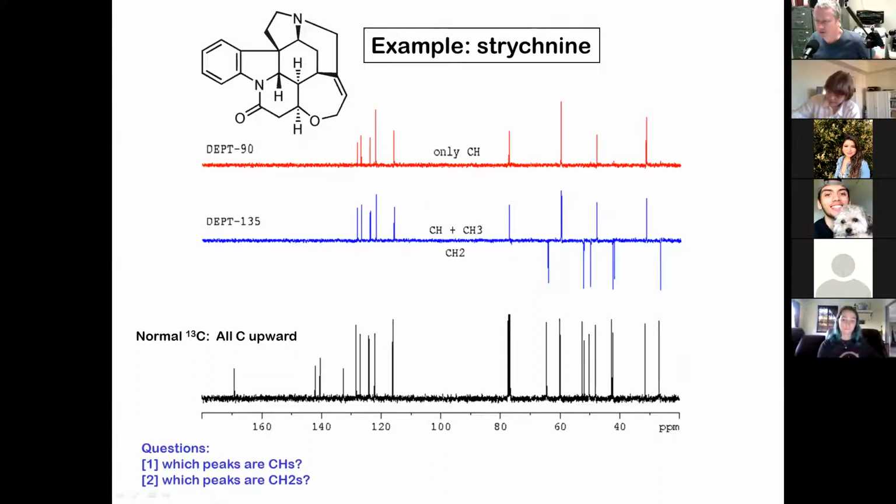Oh yeah, questions. Which are the CHs and CH2s? Well, we figured that out, right? There's the CHs, there's the CH2s. Where are the CH3s? Well, there's no CH3s. And which are the quaternaries? We have at least 4. There must be another one hiding somewhere. It's maybe buried somewhere, but yeah.